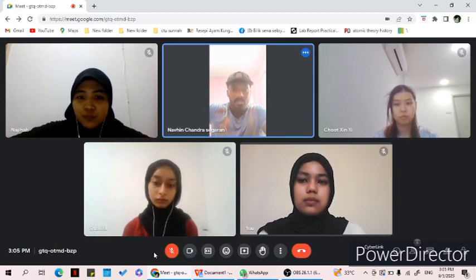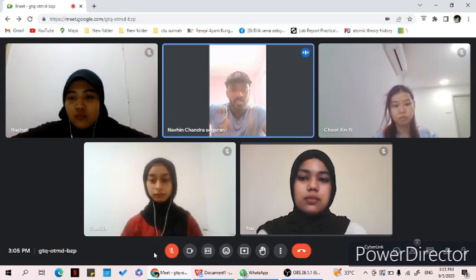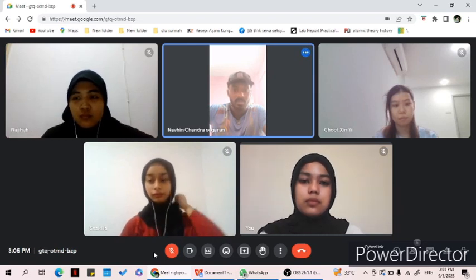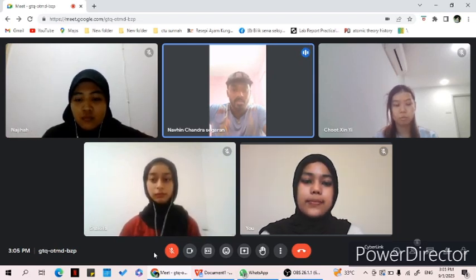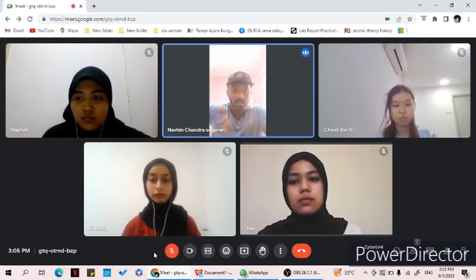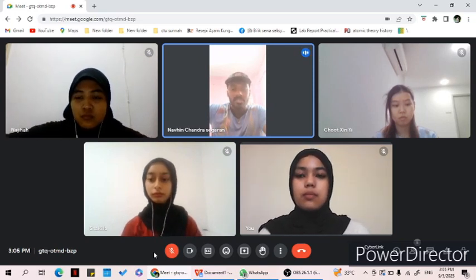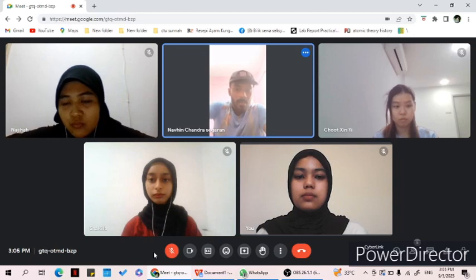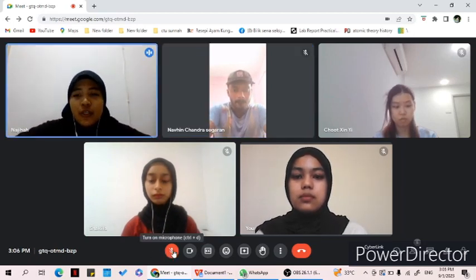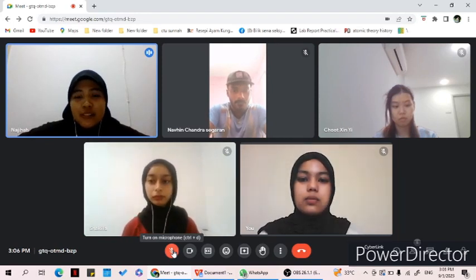Furthermore, in acidic conditions, some of the anthocyanins appear red. Anthocyanins have a purple hue in neutral pH, while the color changes to blue in increasing pH conditions. But in this experiment, the colors are very light, and that is the reason we cannot detect the pH value accurately, but can tell whether it is acid or base from this experiment. That's all. So it wasn't stable enough like the synthetic pH indicator or pH meter.